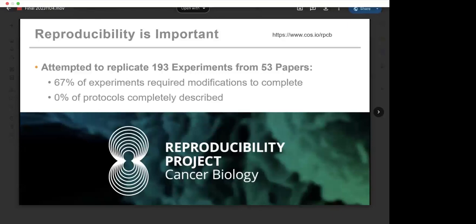Some things like the environment we cannot change. It may not be feasible to buy the same fancy machine for just one experiment. But the more you describe in your protocol, the better the chance others can do the same experiment. And if you can't do something exactly the same way, at least you know what the differences are. Writing everything down each time takes a long time, and protocols.io makes it easier because you can copy and edit your protocols, and even those others have started.